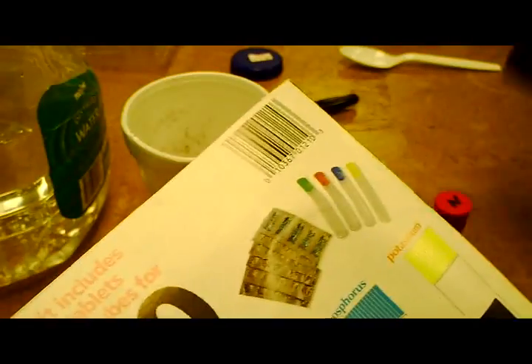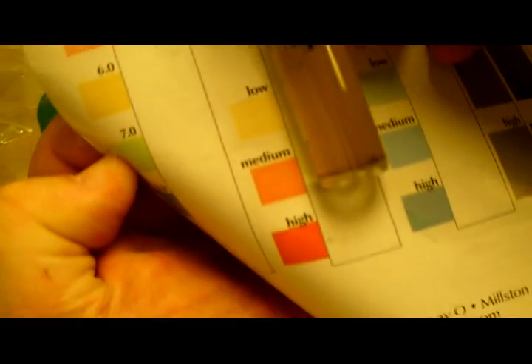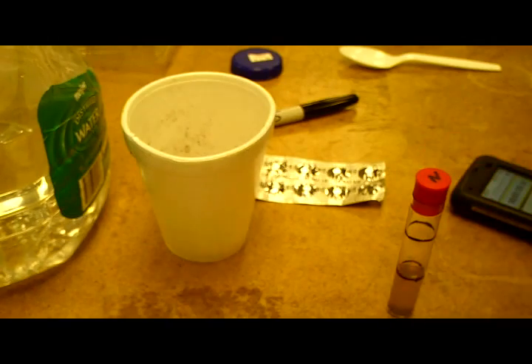It's been five minutes. Here's our nitrogen solution. It's supposed to be somewhere between medium and high, and it is low. I'm beginning to see why nothing's growing.